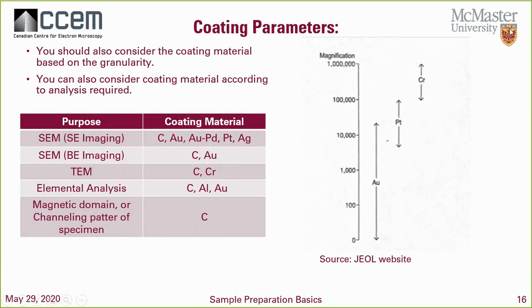Yeah, of course. If you're adding a coating like gold or palladium or platinum or silver, you have to anticipate that you'll see that element in EDS. Of course, you're going to be exciting those X-rays when you start to look at the sample in SEM. You can't help it. That thin coating layer has to follow those laws, those Bragg's laws that we have in place.